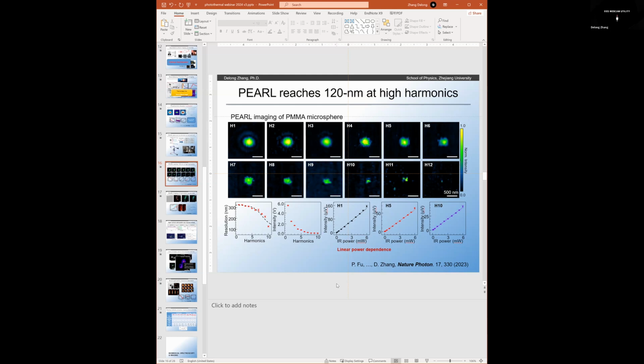But then of course you can always extract the diffraction limited size from the fundamental frequency, which is conventional MIP imaging. And for bigger particles, bigger than the diffraction limit of the probe beam, only the edge matters. So if you can detect the edge in high resolution, then you can have the higher resolution for the whole image. And I kind of missed your first question. I'm sorry, what was that?